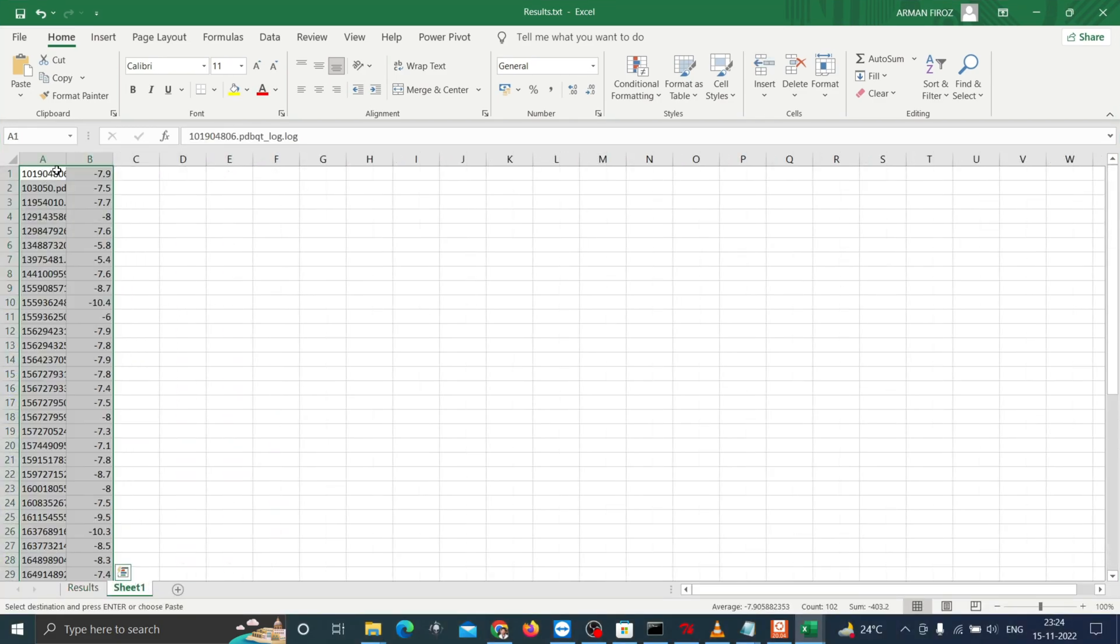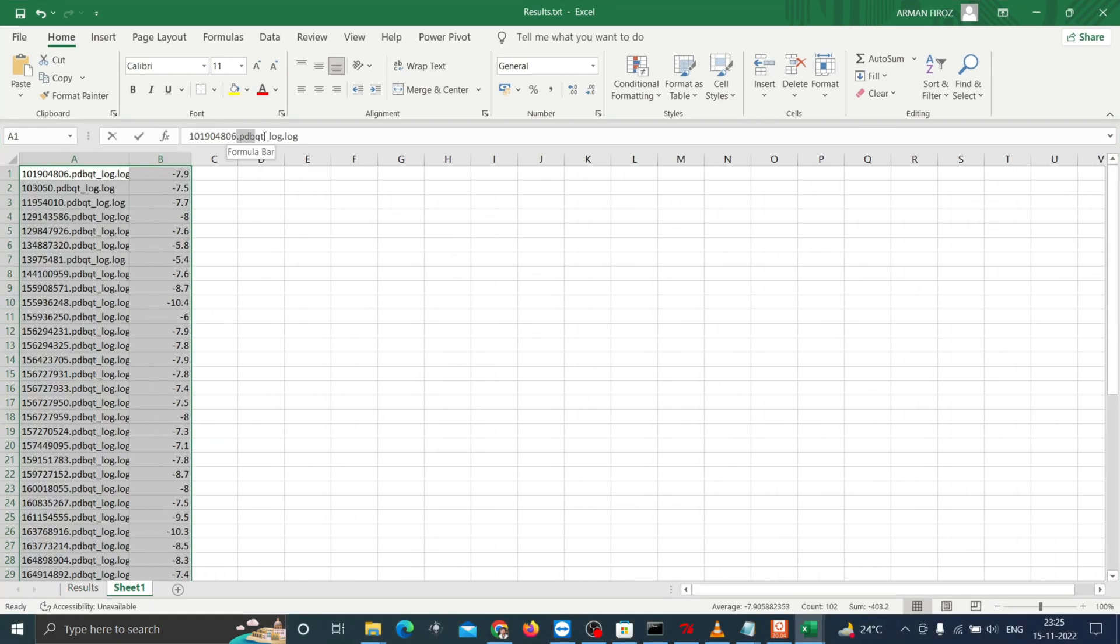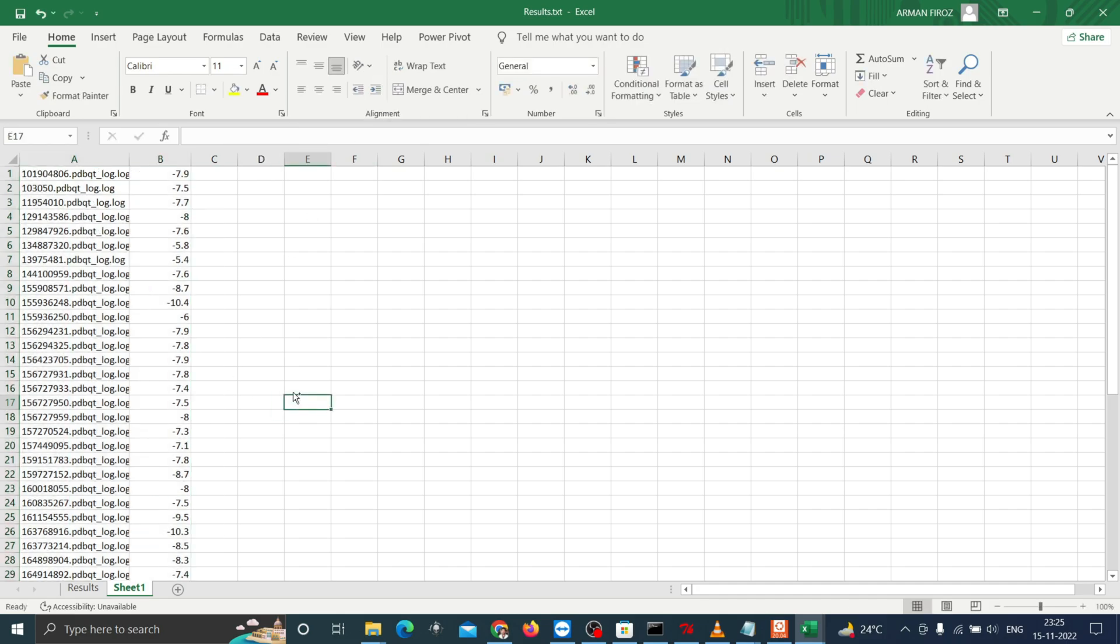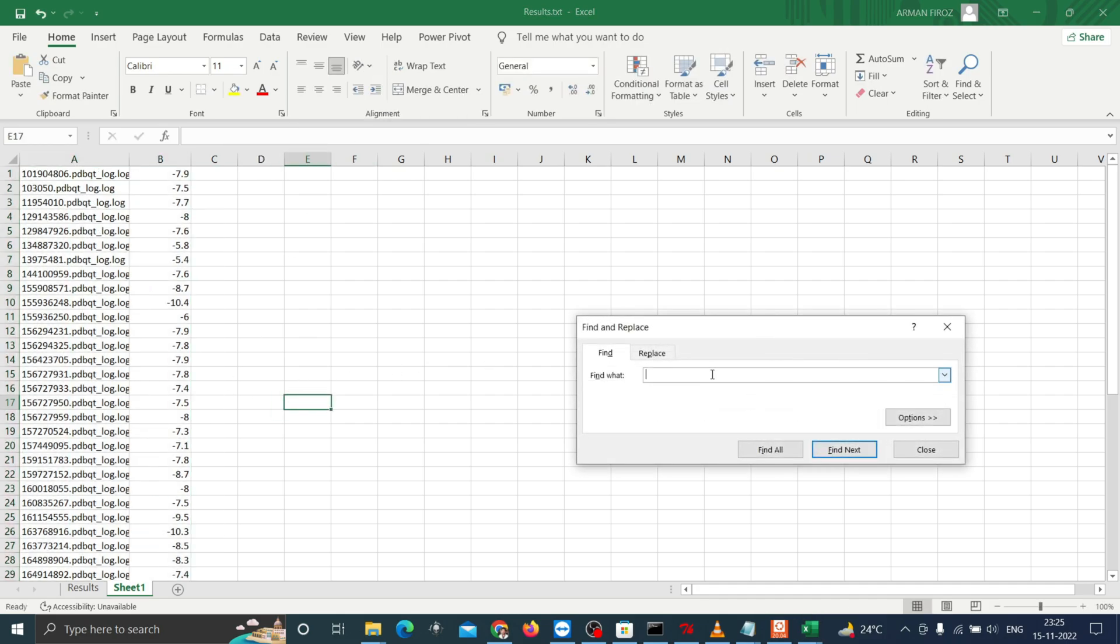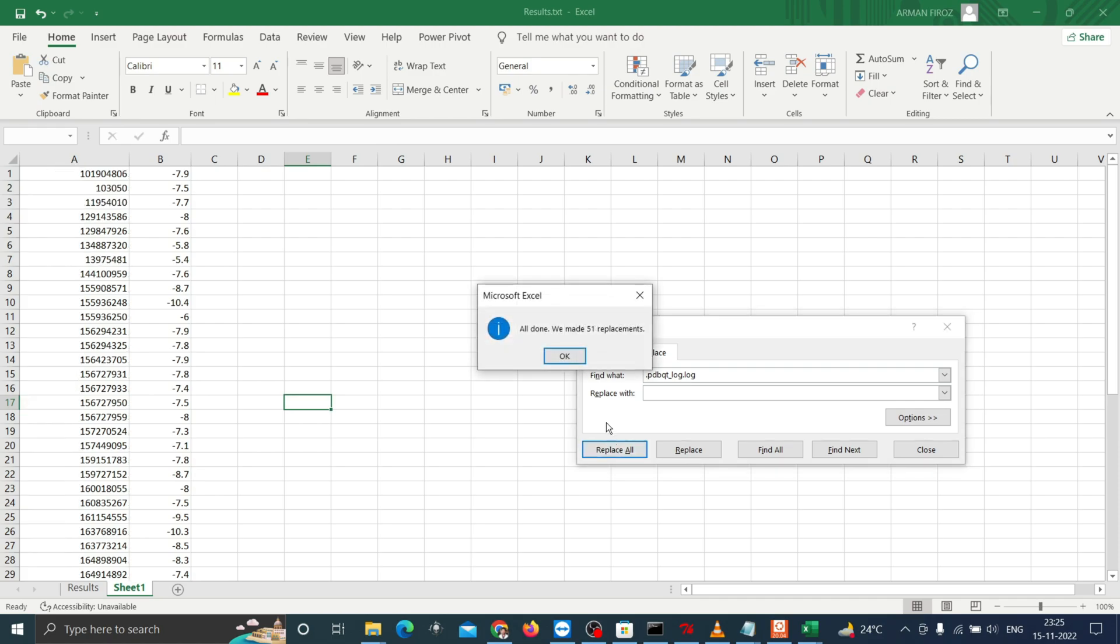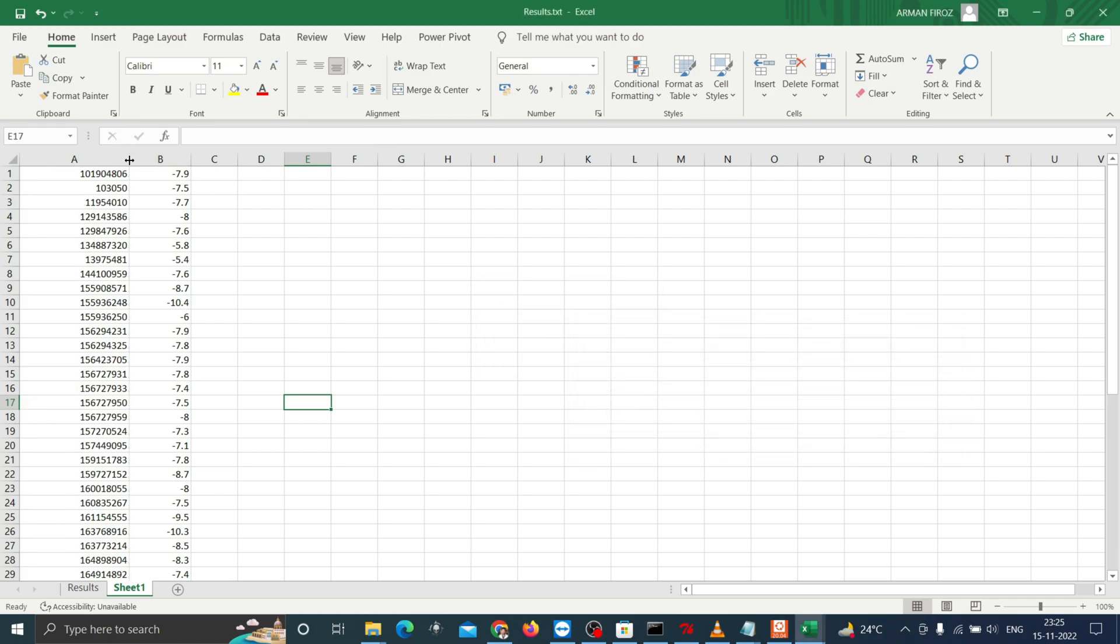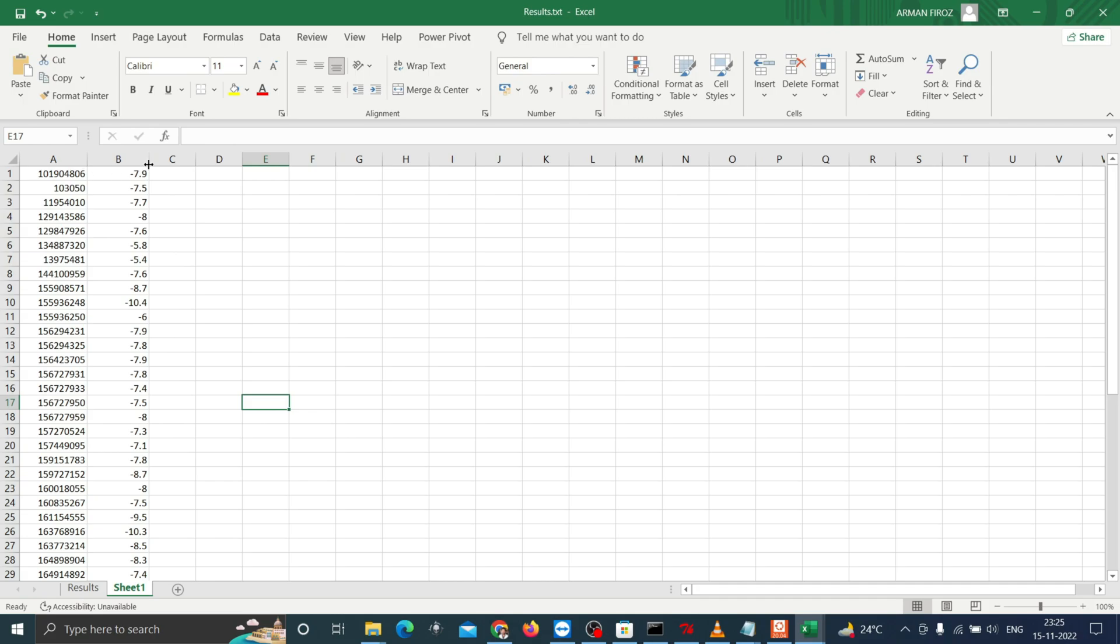Copy the complete results and paste to the next sheet. You can delete the term .pdbqt-log.log by pressing Ctrl F and then clicking on replace all. Now you can see the compound's IDs as a list with their respective docking affinity.